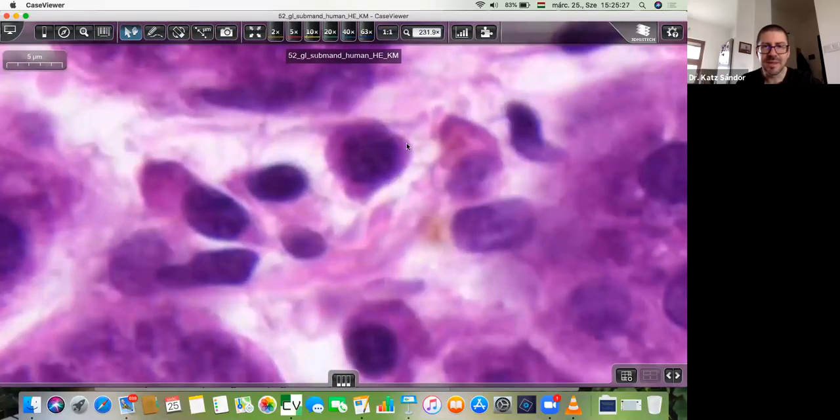This and these are plasma cells. But look at the nucleus. It's not homogeneous because of the huge clumps of chromatin inside, forming a cartwheel-like manner, also called clock face. So here we have the huge clumps in the nuclei. They are really typical for the plasma cells, and there is a prominent rim of cytoplasm.